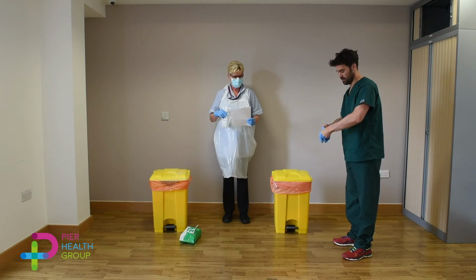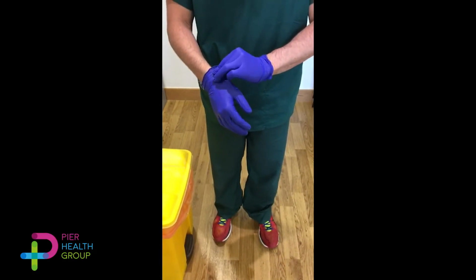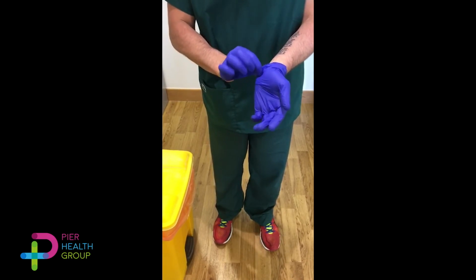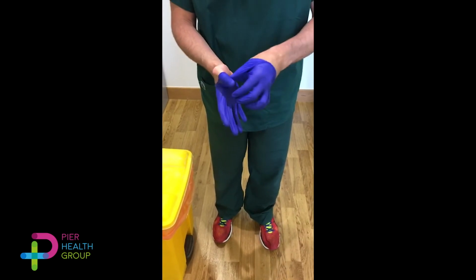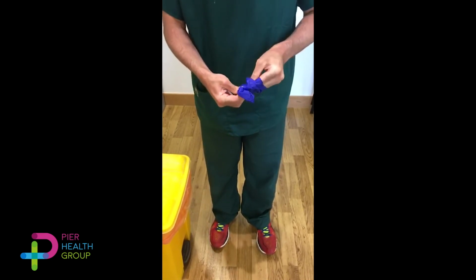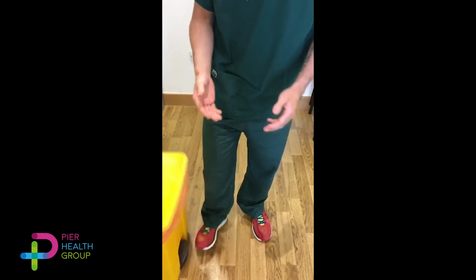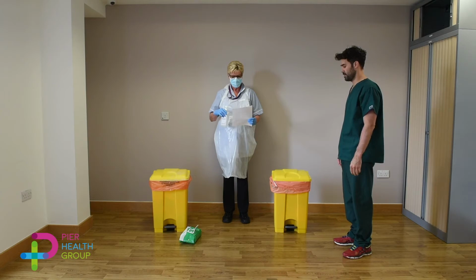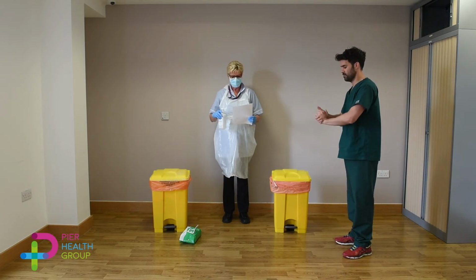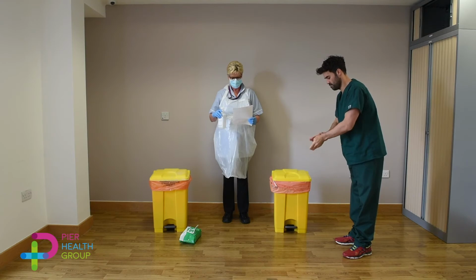Step 13. Remove inner gloves in the same method as outer gloves in an aseptic fashion. Step 14. Use Clinell wipes or hand sanitizer gel to sanitize hands. You can also wipe the face if you feel this is appropriate but not essential for COVID decon. Wipe from the inside out and changing wipes regularly.